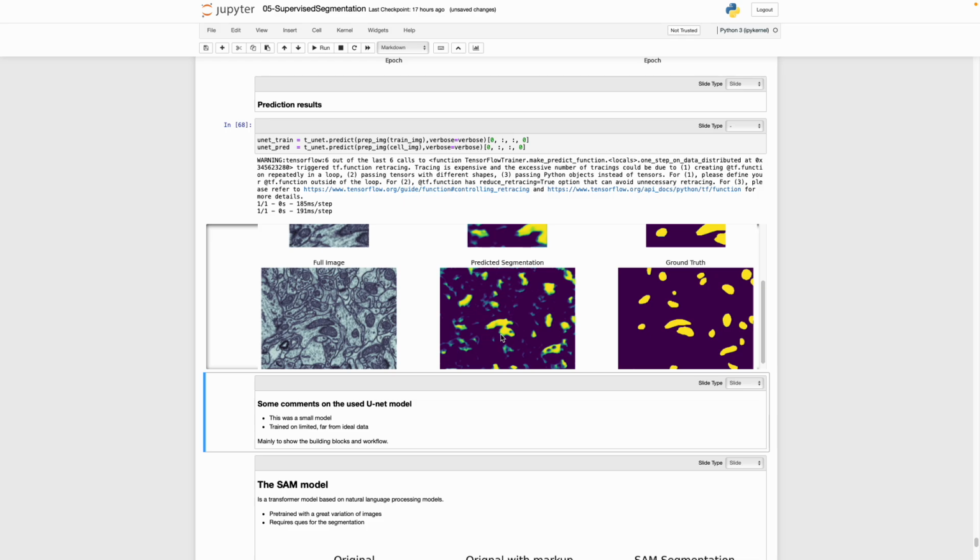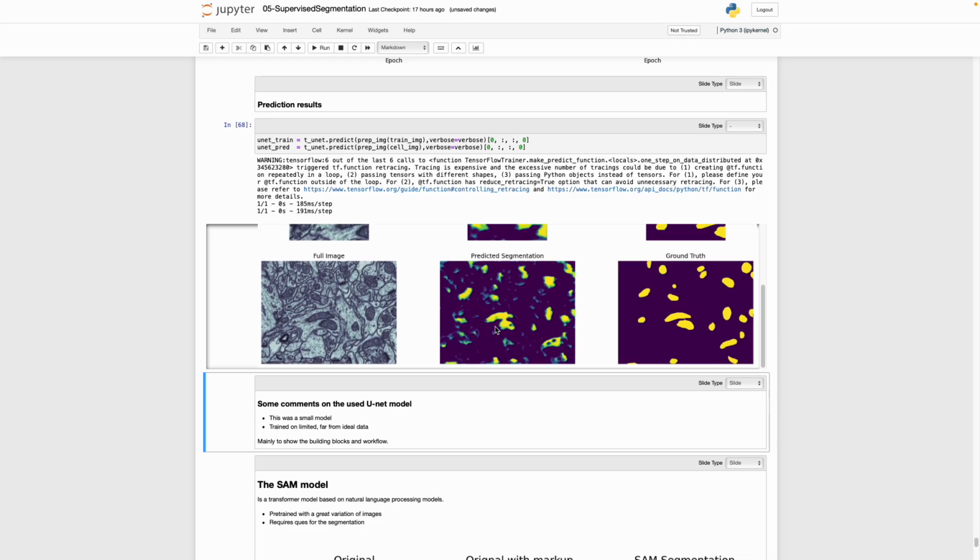What you get here is a probability map, so it's not really black or white, but it's the likelihood that it is belonging to the class you ask for. And then afterwards you have to do a thresholding, which is easily done with Otsu or something.